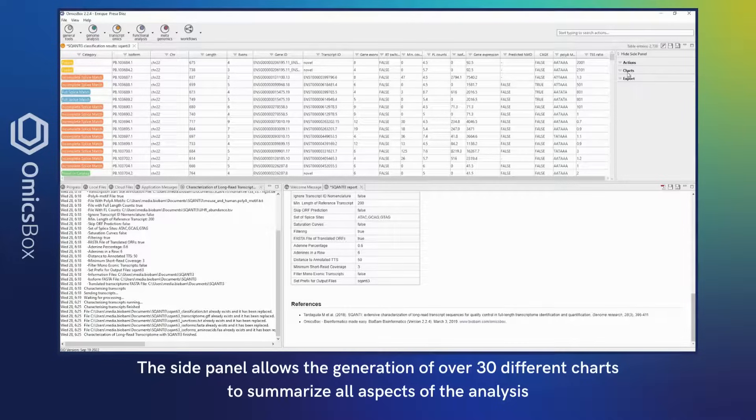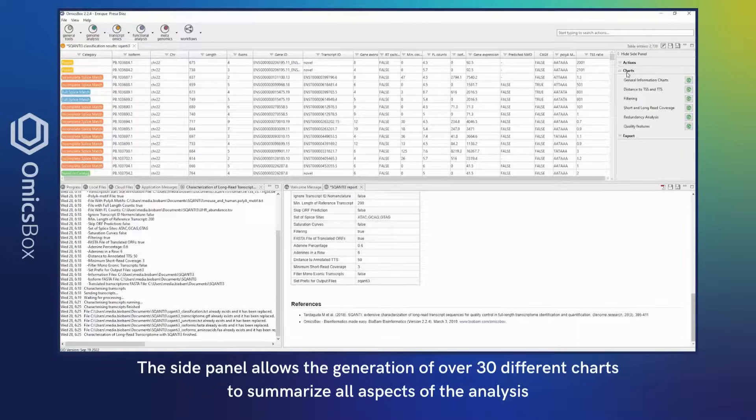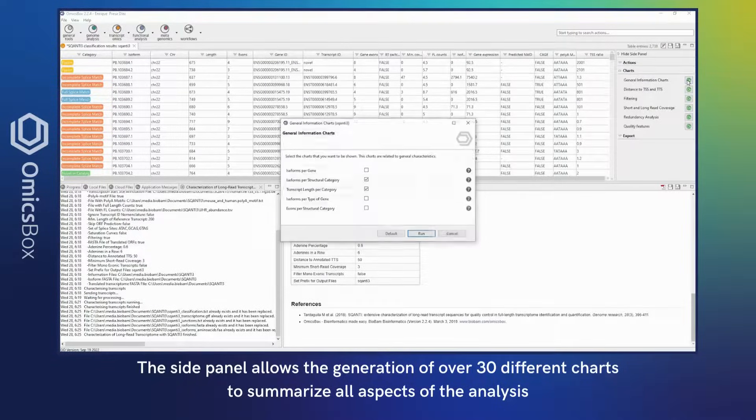The side panel allows the generation of over 30 different charts to summarize all aspects of the analysis.